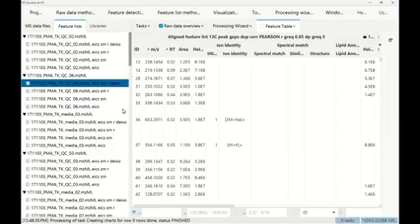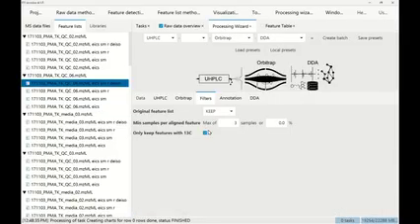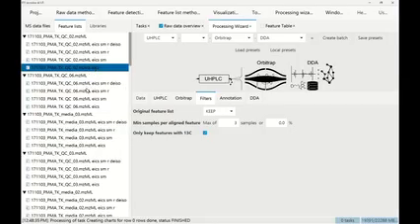And I got all those feature lists because in the processing wizard, I set everything here to keep. There were some filters, and I set everything to keep, not to remove. I think keeping is very good if you really optimize your batch. So if you're optimizing your batch and you have a feature that you were looking for, but somehow it was lost in the processing, or maybe you have a double peak and now you want to optimize this, it's very good to keep all the feature lists. Now we can go back into each individual step and see, okay, here I missed it. Yeah, here I made something wrong. So then you can optimize your processing.